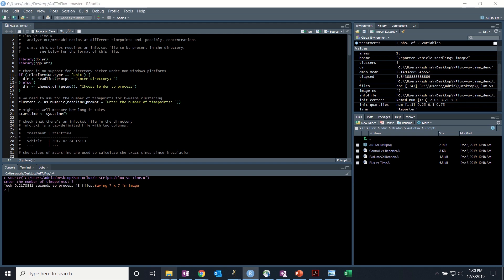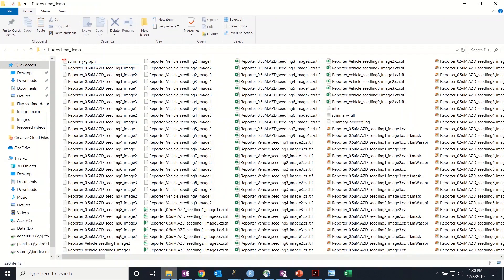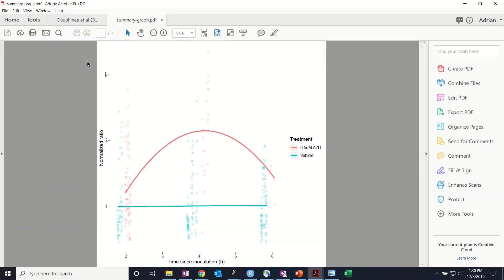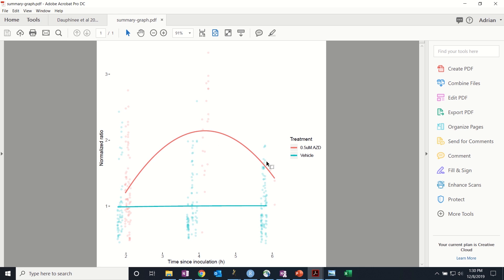Now if you go to the file, you'll notice that there's now a summary graph. This shows the normalized ratios over time since inoculation, which is represented in hours. And this is normalized ratios to the vehicle.